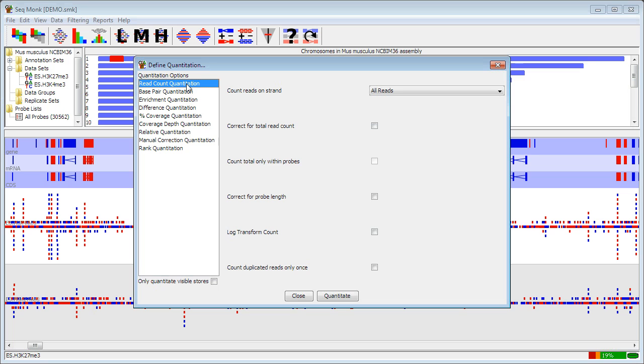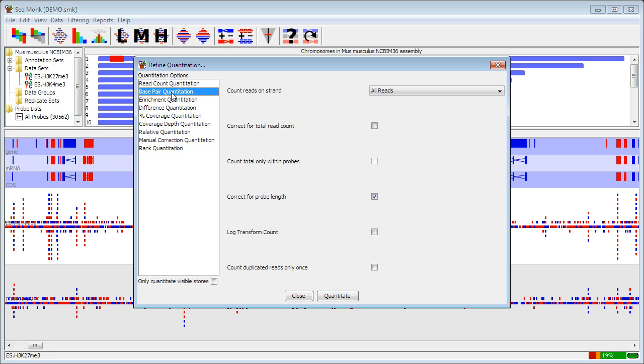The simplest one is a read count quantitation. There are various options within this, but the basic idea is it just counts how many reads overlap with each probe. Base pair quantitation is similar except that instead of just counting a read as overlapping or not, it actually counts the number of bases of that read that overlap. So it's more quantitative, especially for short probe regions.